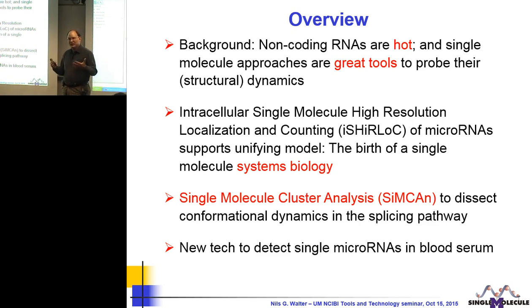Many of you will be familiar with cluster analysis, and we applied it to single molecule fluorescence resonance energy transfer (FRET) data in order to really dissect a very complex biomolecular machine, the spliceosome, and I'll tell you a little bit about this. And last but not least, I want to talk about a very exciting new project where we detect single microRNAs inside blood serum from patients.